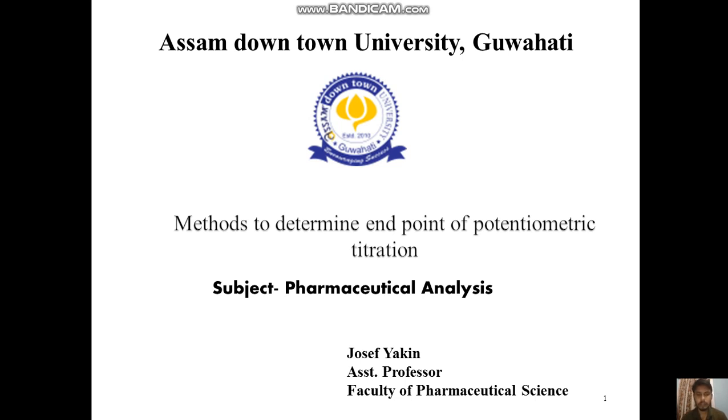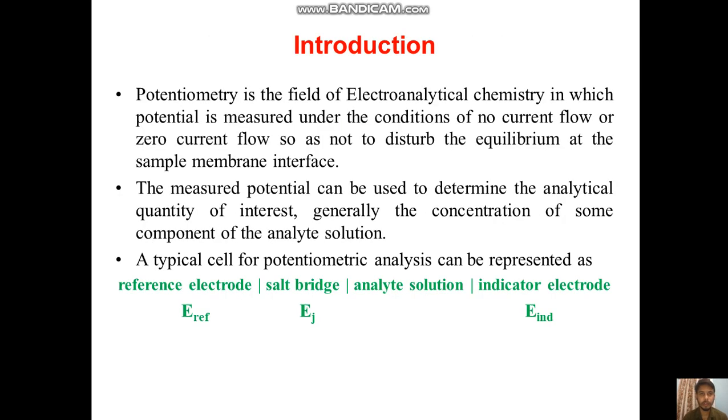Today I will discuss one topic, that is methods to determine the endpoint of potentiometric titration. Ultimately, we are going to discuss endpoint determination of potentiometric titration. Some different methods are there. We'll see one by one.